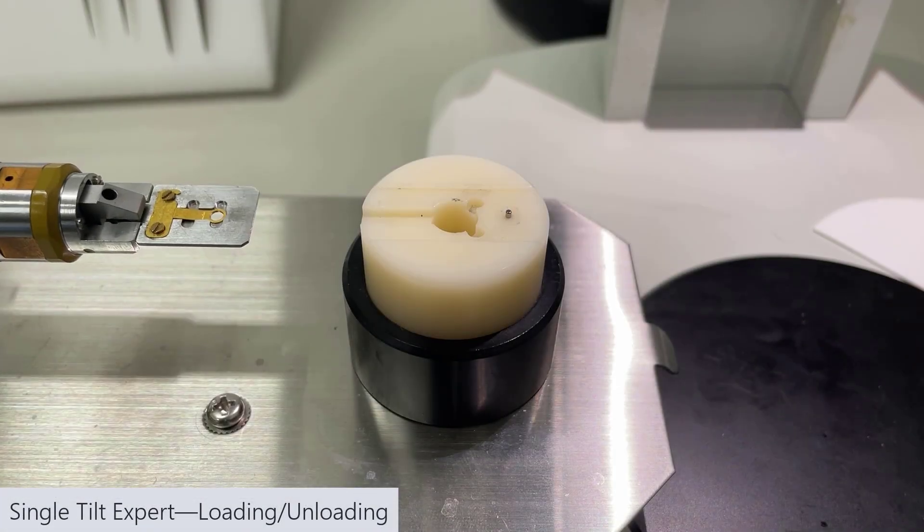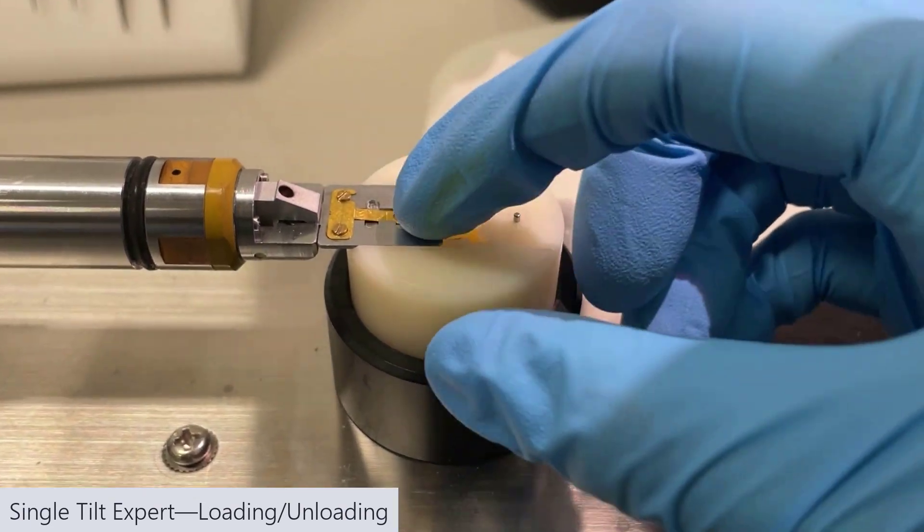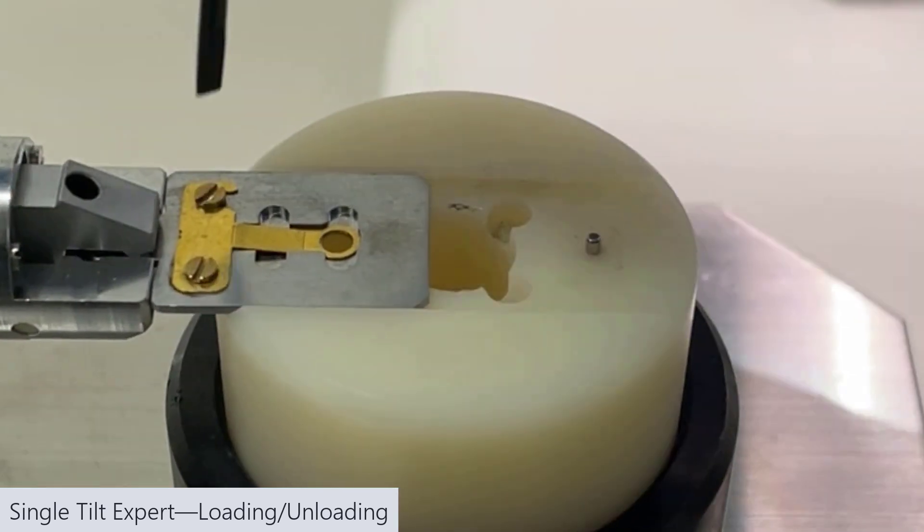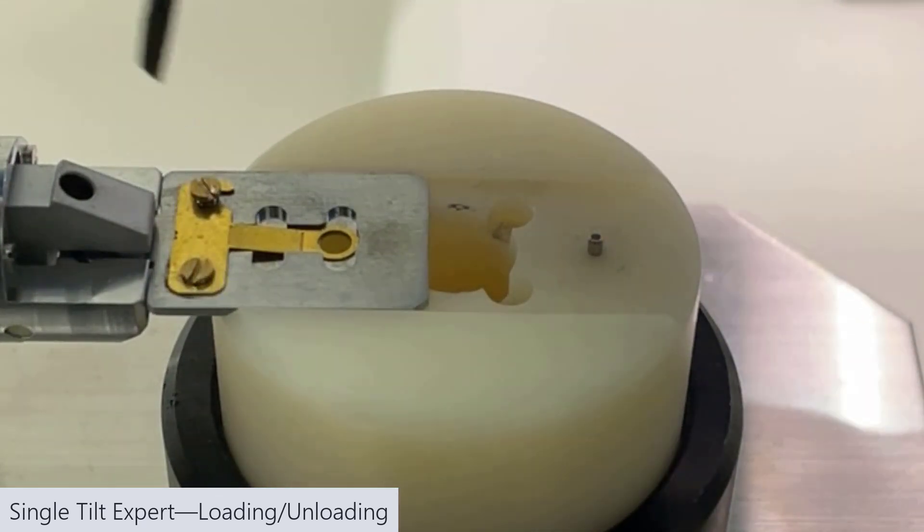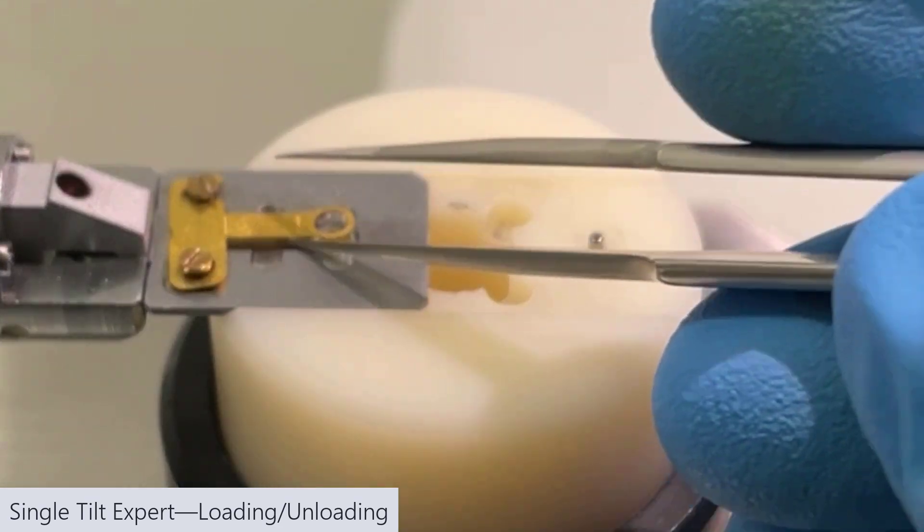Now as I mentioned, some labs will leave the blade on all the time. So if your lab does that, it's a little bit more difficult to load the sample, but it is quicker. In that case, just loosen the two screws. You want to loosen them enough that you can actually move it out of the way.